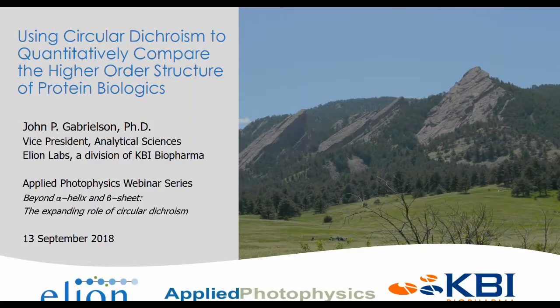Thank you, Keith, for the kind introduction. And as I begin, I want to start by thanking Applied Photophysics for the opportunity to present this webinar today. In this webinar, I'll be discussing the use of circular dichroism for a variety of purposes during biologics development, specifically focusing on using CD for quantitative comparisons of spectra.